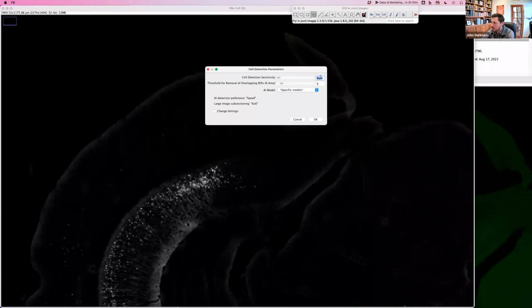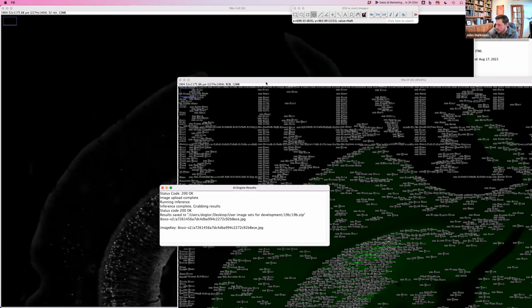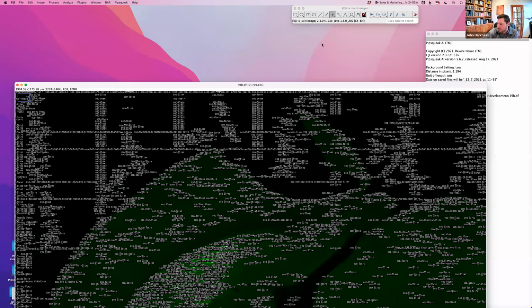And run it again with some AI settings, and it's pretty cool because it's helping the AI really focus in, even though it's never seen an image like this before. It's never been trained on anything this big. We're able to go in, and I think it's going to produce some result here that's well, a few artifacts on there, but you get the idea of how this type of approach can help the model go in and find those targets, and it's going to convert these.